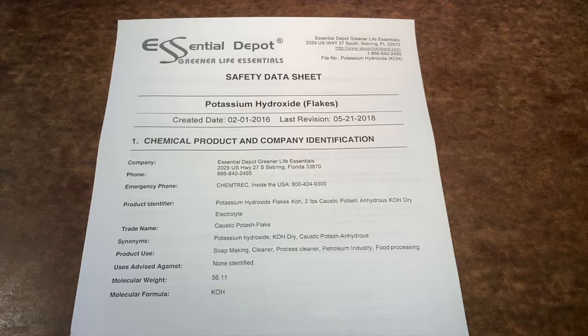To help illustrate some of the thought processes that go into a hazard review, I've recycled a video I made last year in which I conduct a hazard review of a home lab experiment involving alkaline hydroxide solutions. Due to the pandemic, we were all stuck at home, and the students had to do labs in their kitchens, so it was even more important that the students had a well-conceived safety plan, since neither I nor the TAs would be there to intervene. Although the hazards are quite different from what you're dealing with in the UO lab, the underlying steps and thought processes are exactly the same.